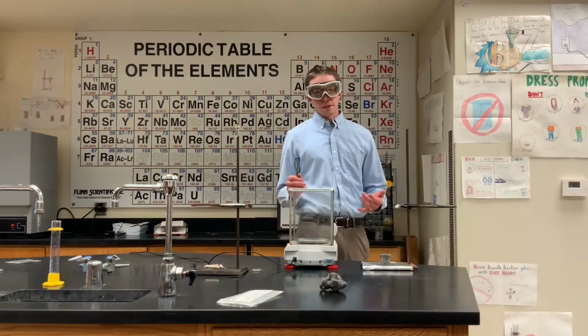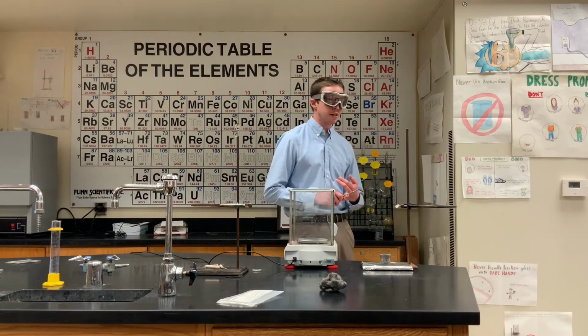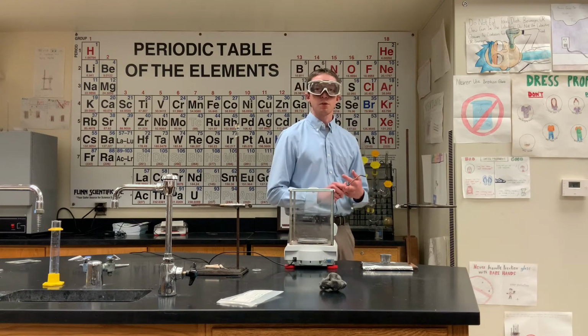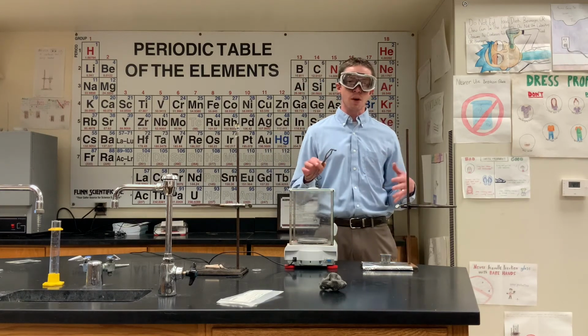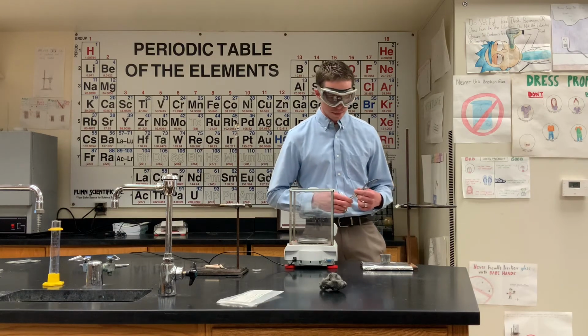All right, so here we are. We have added the water to decompose the nitrides. We heated once to drive off the water, then we took the mass, then we reheated it, and now we're about to take the final mass and make sure that they both agree, because we wanted to make sure that all of that water was fully driven off by the heating process.